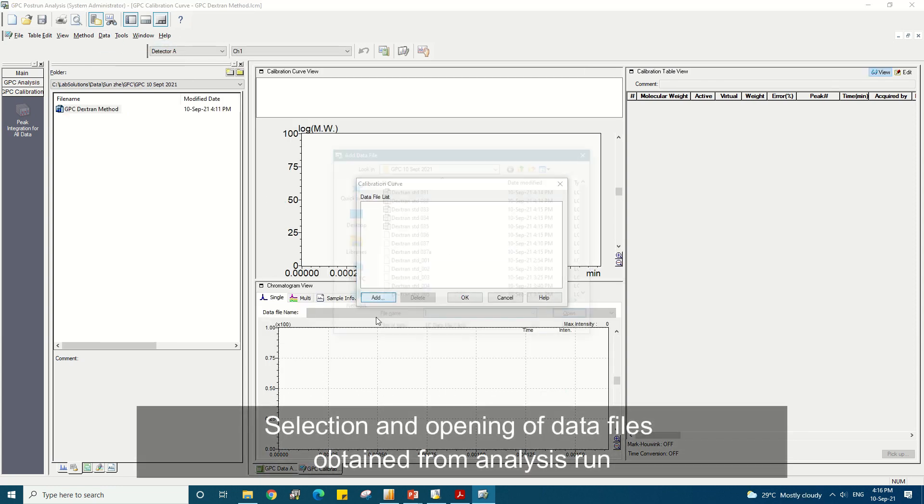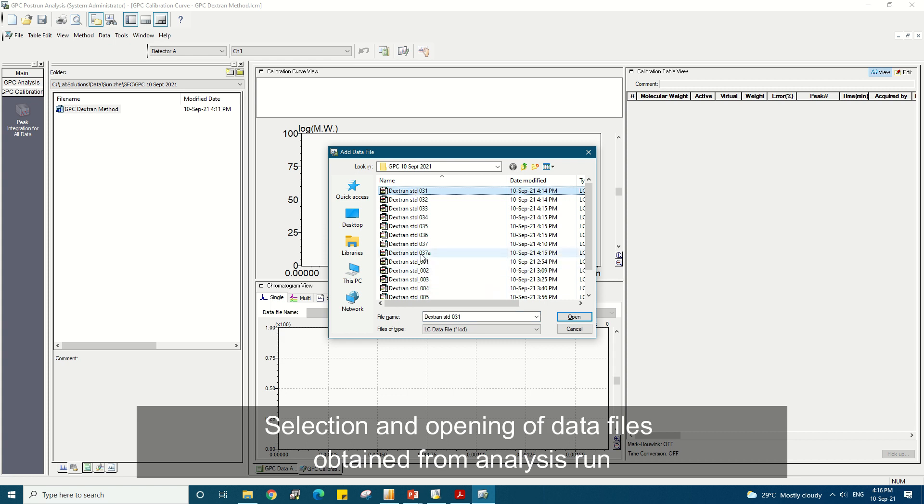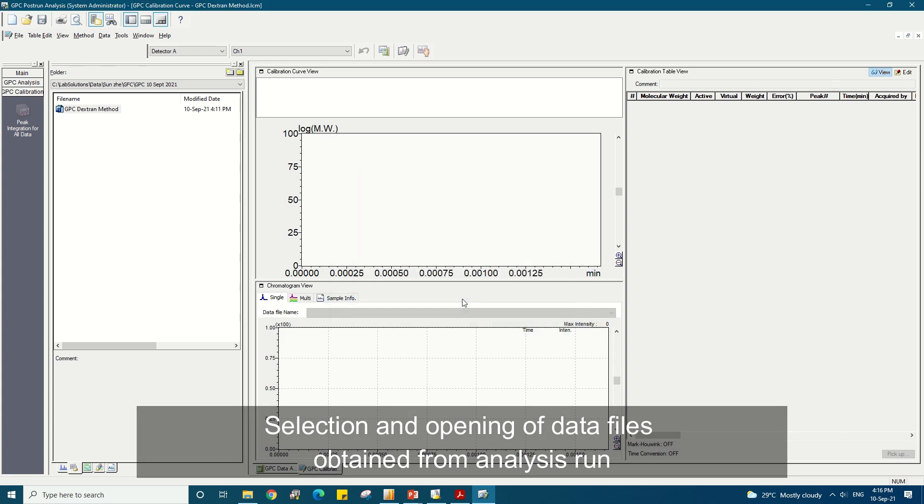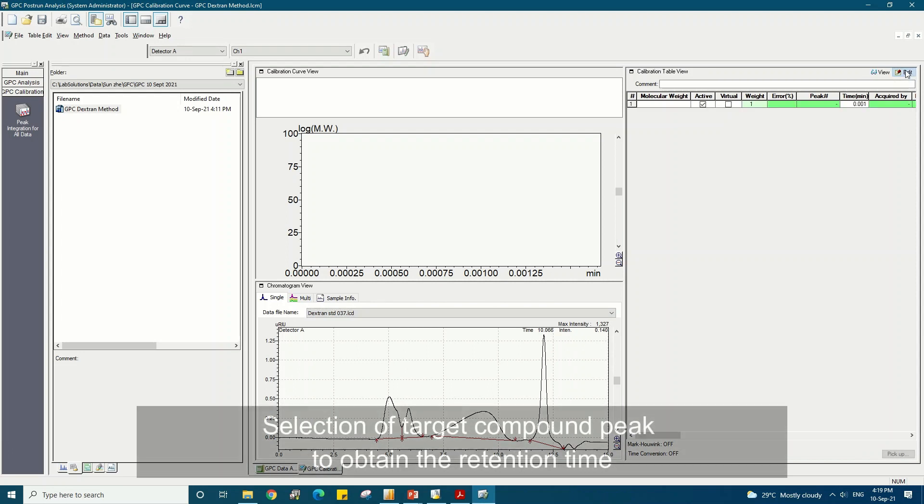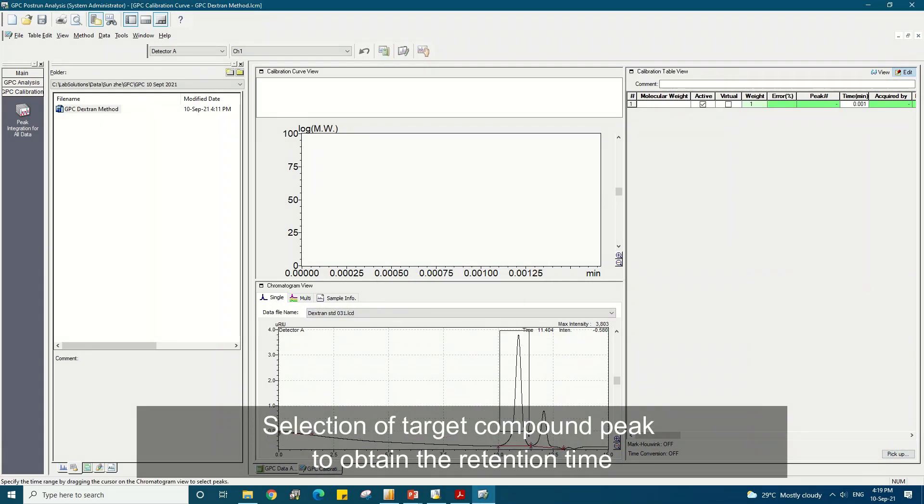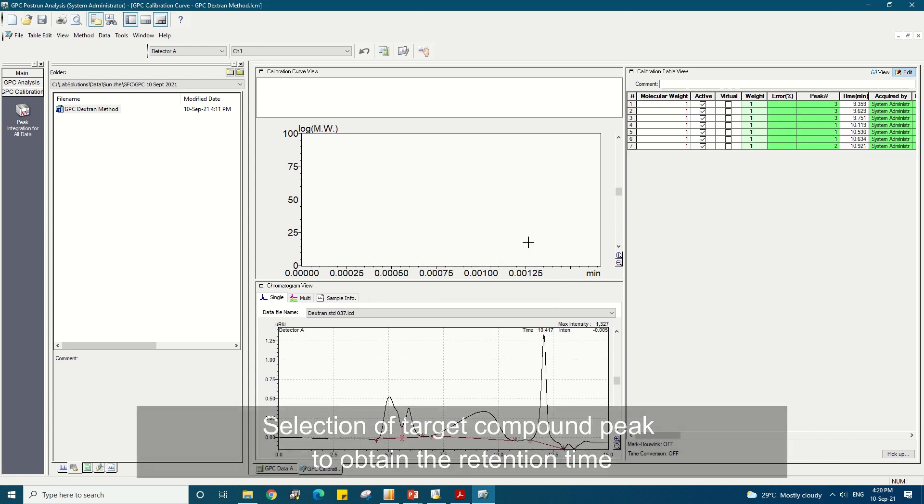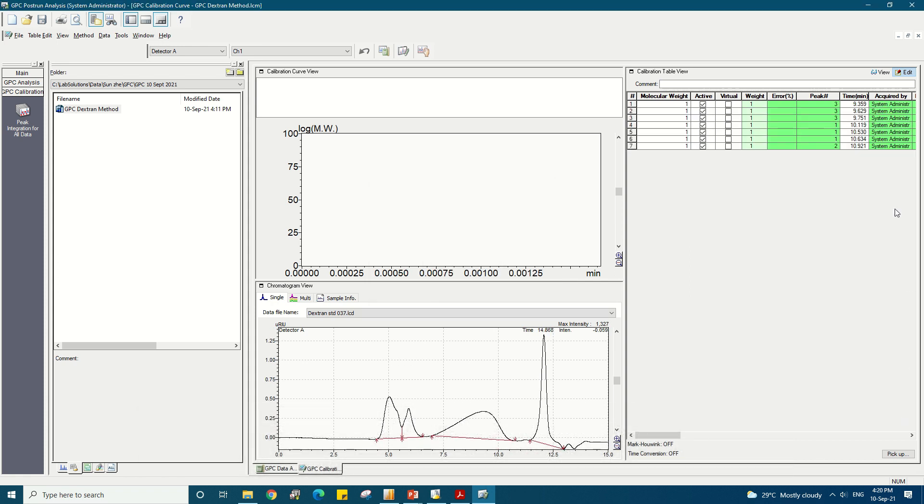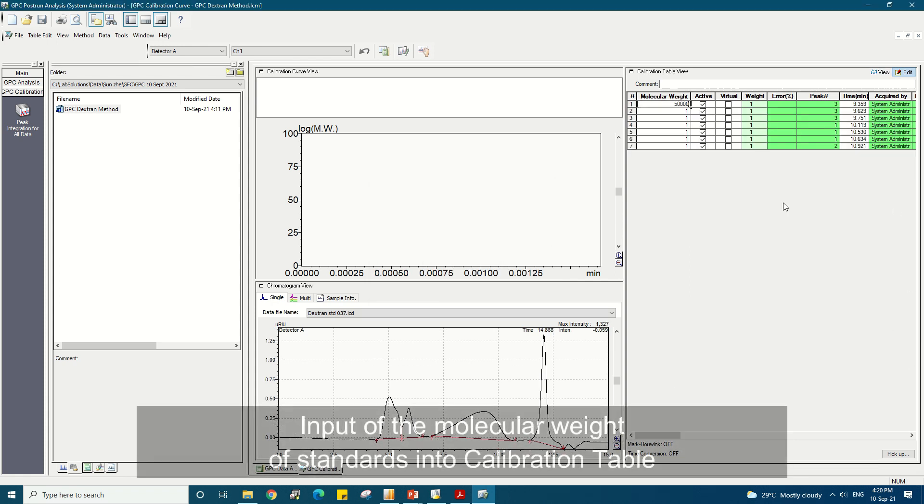In the data file list under the data menu, add the raw data files of the standards. The retention time data of the target compound peak of each standard is selectively picked up and added in the edit mode of the calibration table. With the retention time inputted into the calibration table, fill in the molecular weights of each standard accordingly.